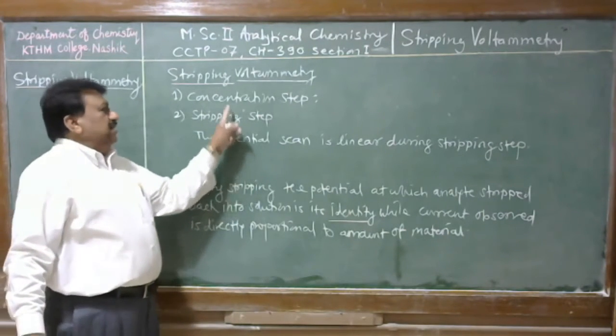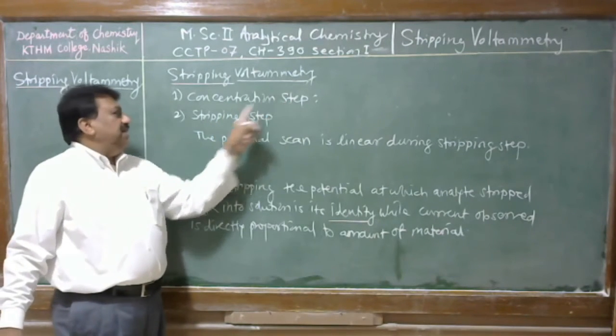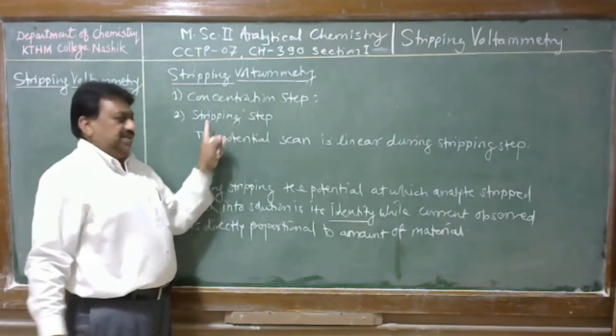But here, the concentration step is carried out by stirring the solution, and stripping step is carried out when solution is quiescent.